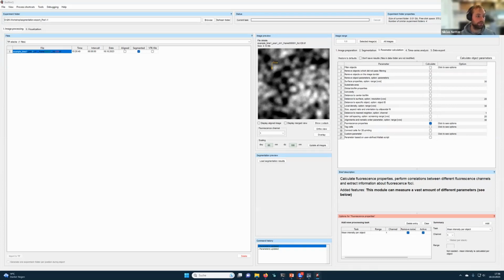No, BiofilmQ did not segment it. It was importing it. So is this your question? We did not segment with BiofilmQ. We just imported the segmentation that was previously done in Napari and StarDist.